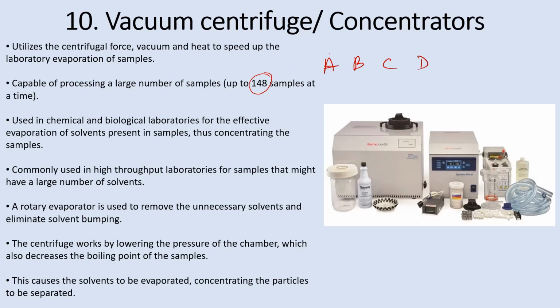So there are some students who are working on biomolecules A, B, and C. So they have some samples to be evaporated. Now this person has, say, 20 tubes, this has, say, 30 tubes, this has, say, 40, and this has 50. So they all decide on a day, because it's a big equipment. Only for 20 samples, why do we run one equipment? So they all decide on a particular day, and they say, okay, my samples will be ready on Monday. Let's start this particular centrifuge together. So we are using it in a proper way. So they all put their samples in.